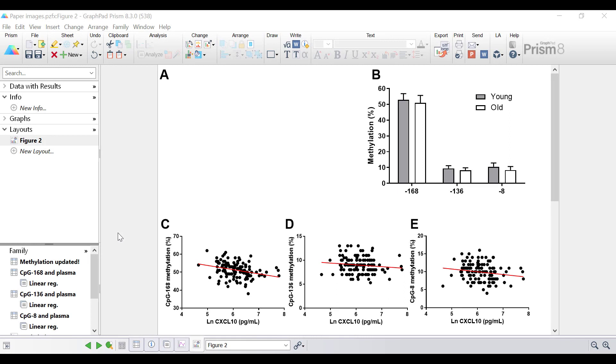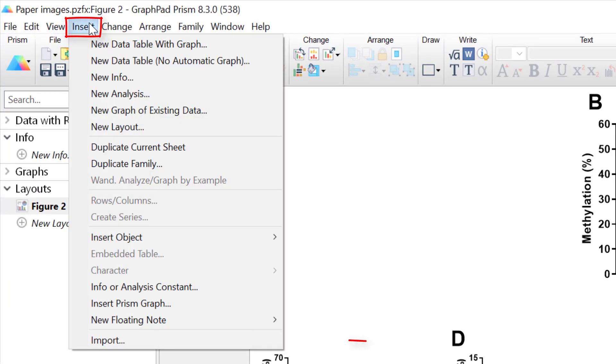Within Prism I have a layout page open. To insert a picture with a graph or layout window open simply go to insert import picture if inserting a picture to a graph or insert import if inserting a picture to a layout page. Since I have a layout page open I'll go to insert and then import at the bottom.